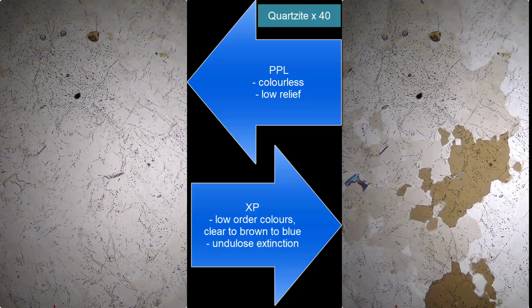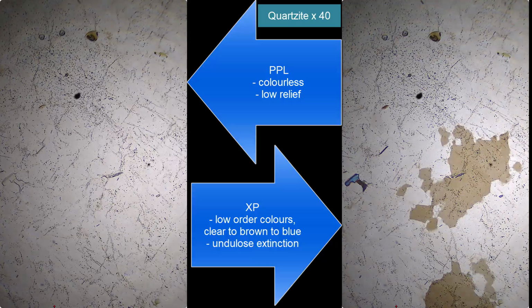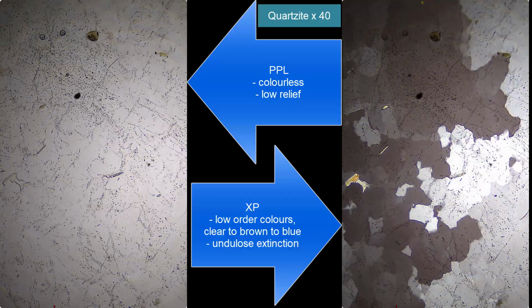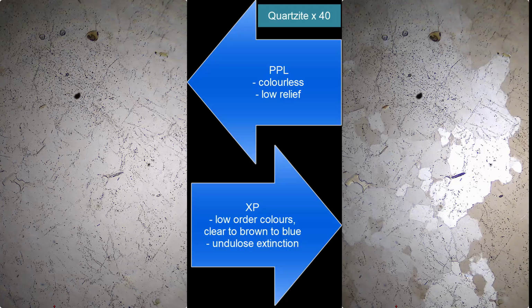So this is the first sample of quartzite, and it's sort of like a positive control because everything you see is quartz. So you can learn the features here for rocks that contain mixtures of other minerals besides quartz, because whatever is here you can trust to be quartz.